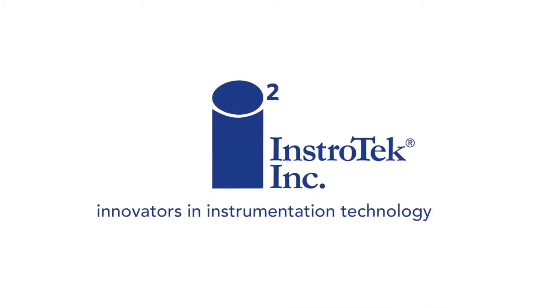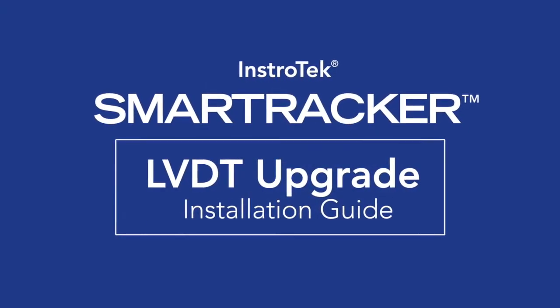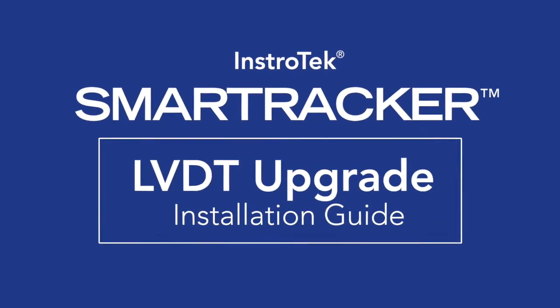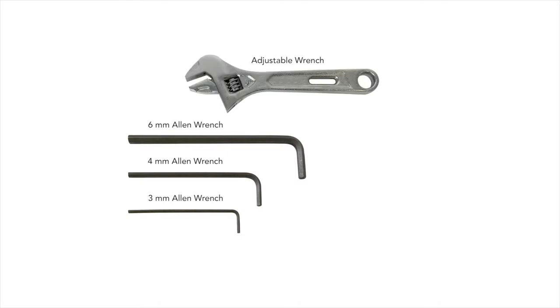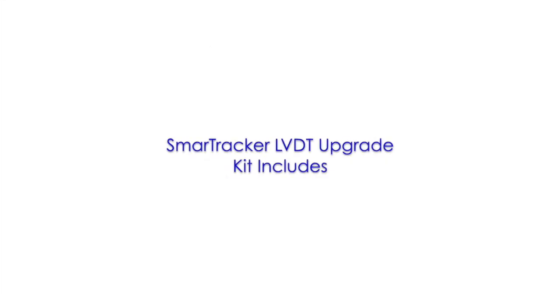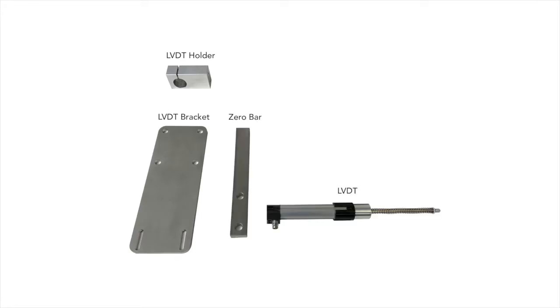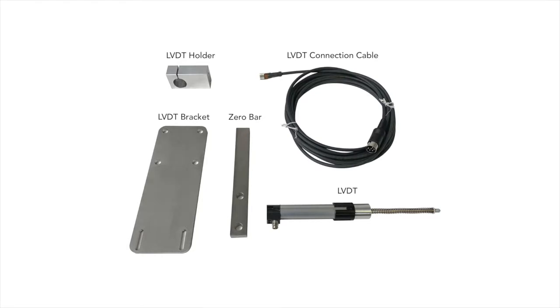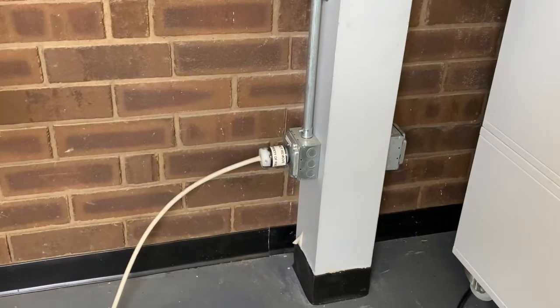Thank you for joining us. Ensure the power is removed by turning off the SmartTracker and unplugging the SmartTracker.